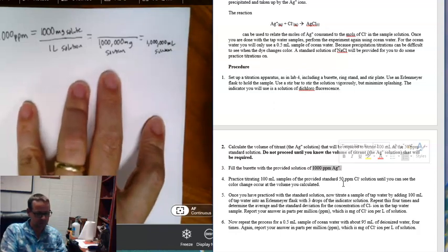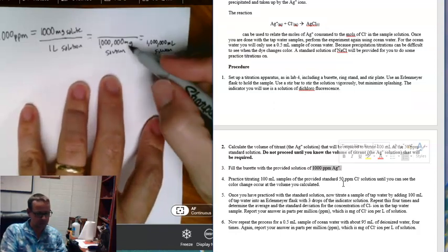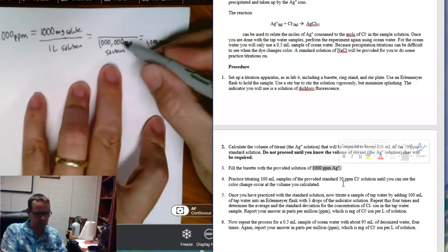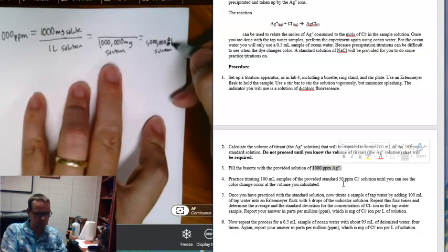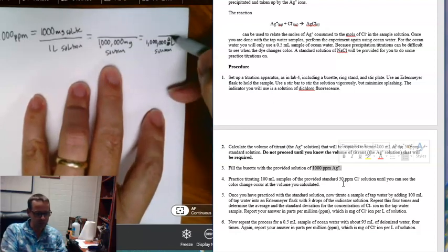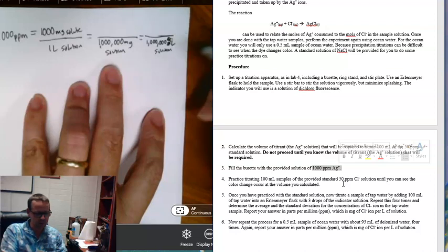All right. So, let's see, did I do that right? No, sorry, it's not the same as 1 million milliliters. It's the same as 1 million microliters, because 1 milligram of water weighs 1 microliter of solution.